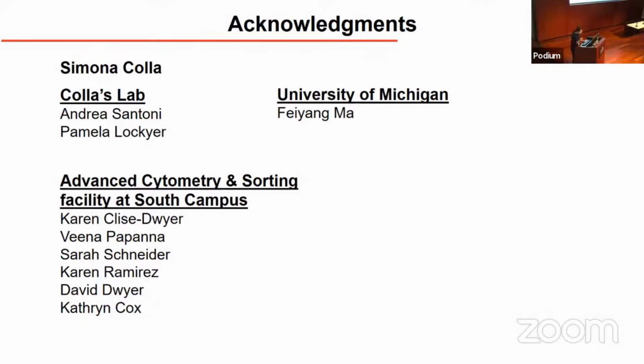Hello, everyone. Thanks for the introduction and thanks for the opportunity to present in this meeting. Today, I'm going to share our work about a small-size particle called carbon black. By its nature, this particle is black, so it can block the fluorescent signal. So I would like to share how we overcome this difficulty and analyze the role of this particle in lung immunity.